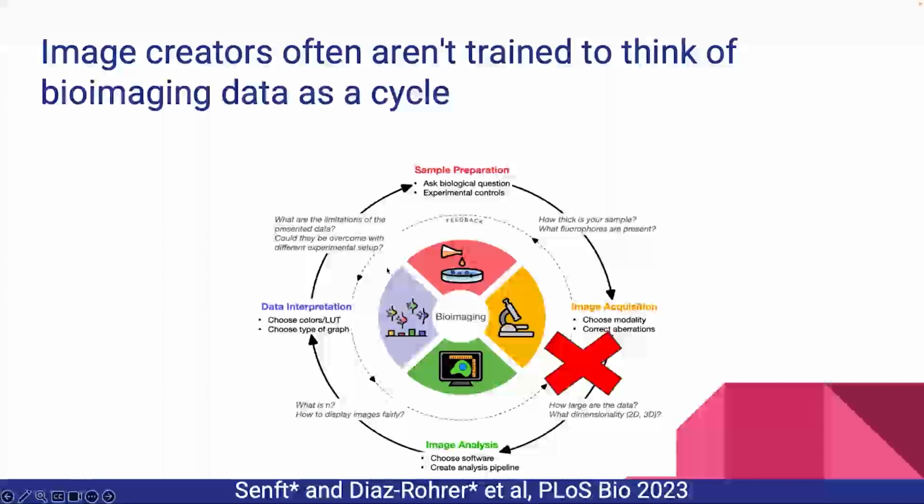So we recommend that you think about your image analysis as soon as you start thinking about doing a microscopy experiment, and as soon as you have pilot images with controls, because you took those, right? You did some controls and took some pilots. I know you guys did that. You use that to do a preliminary analysis and see if there are actually things that you need to change at the bench so that your life at the laptop gets a lot easier.